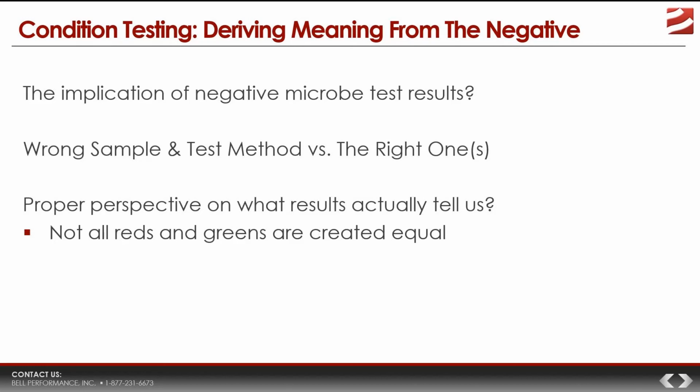Now, if it's water, you've got a different scale because you need more microbes in water to indicate a problem. But you're going to get raw numbers, and then they're going to be interpreted. Red, yellow, green. Not a problem, might be a problem, or severe contamination, you need to do something. So red, yellow, and green correspond to ranges of total microbes that were detected by the ATP test.